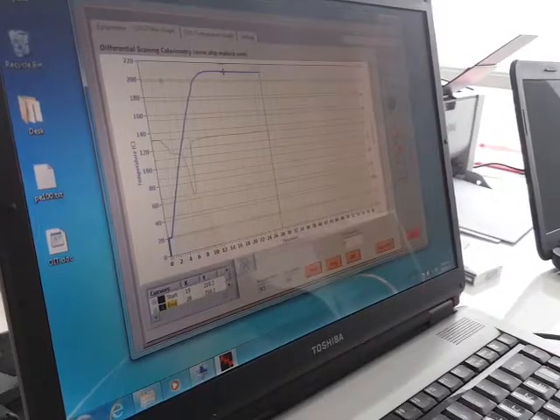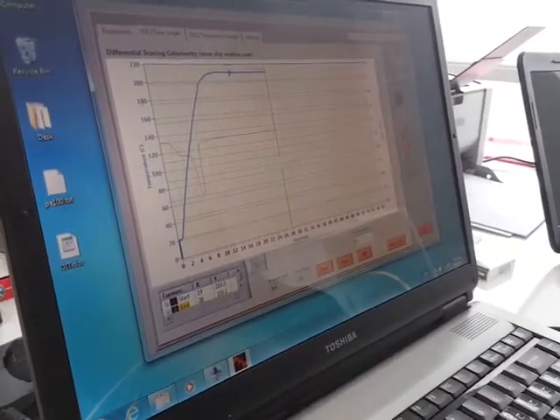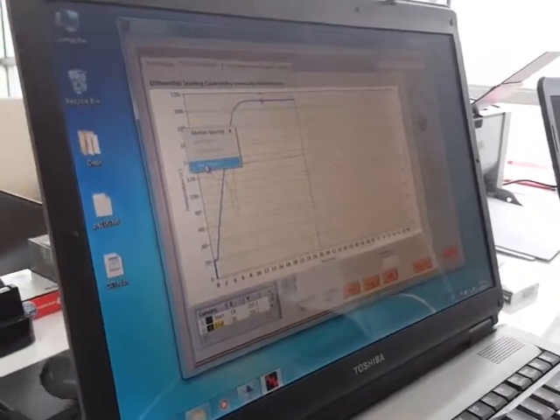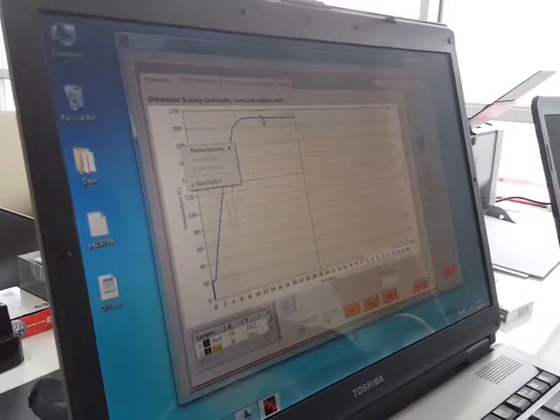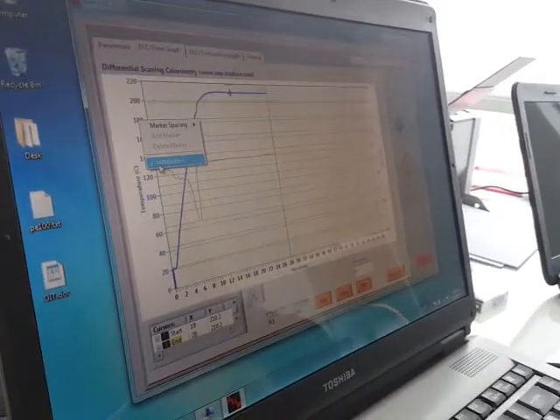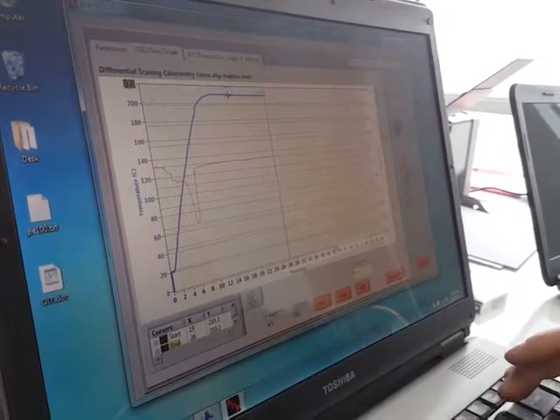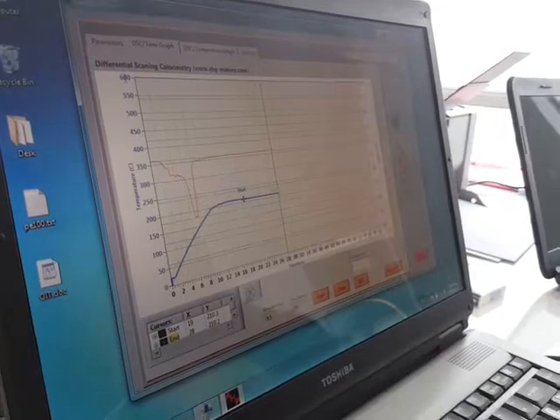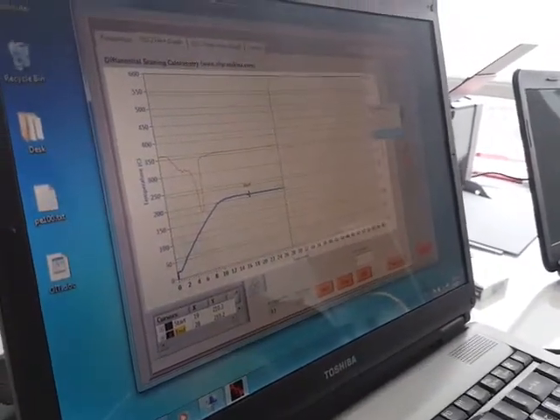It means that the maximum level of the vertical axis can be selected automatically based on the maximum value. If you want to change it manually, turn auto scale off, and you can easily define the maximum value manually. You have the same capabilities here.